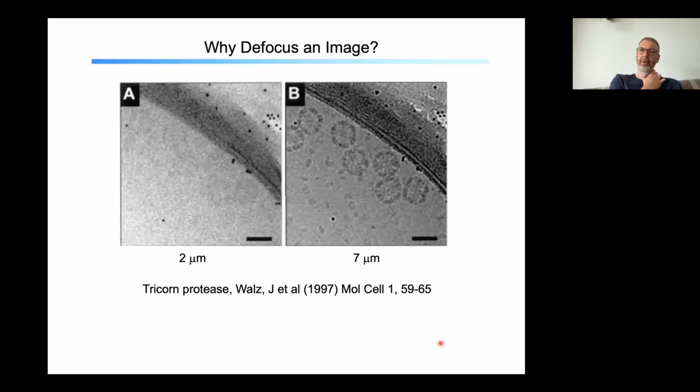So, why defocus? As you can see from the previous slide, low scattering angles, which are equivalent to the coarse details in our images, don't get any real path length change. So essentially those spatial frequencies are either not transferred or not transferred very well, and we are not able to see the object. So what defocus does is change the spatial frequencies that are represented in our image, so that it makes it easier for us to see our object of interest.